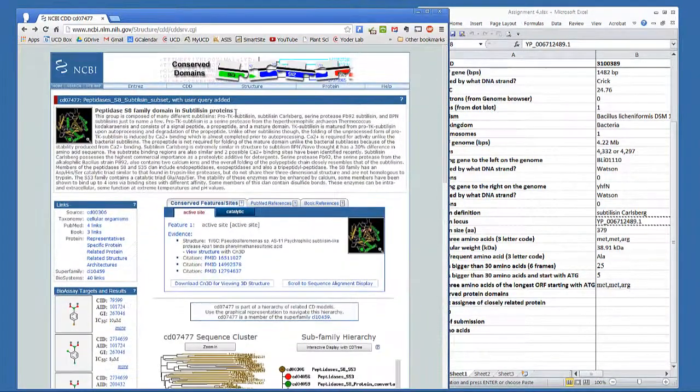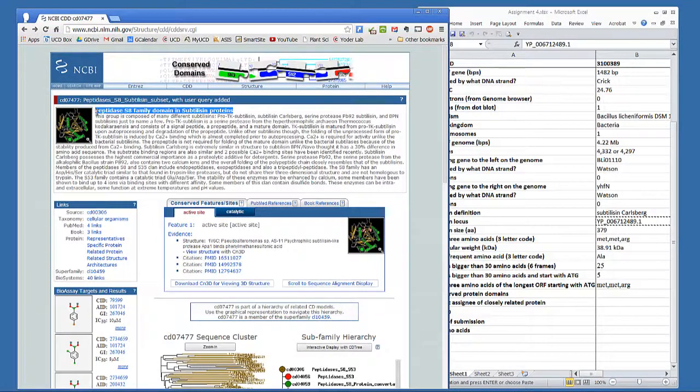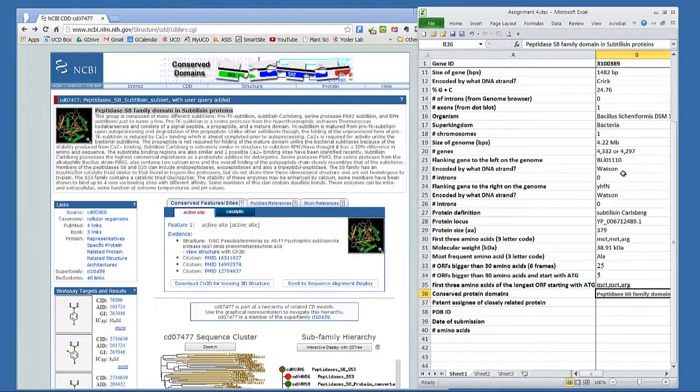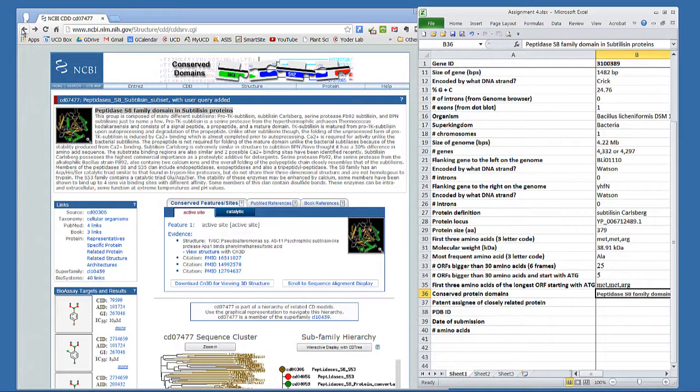Put the name of the domain into the spreadsheet. Some proteins have more than one domain, but you only need to show one of those.